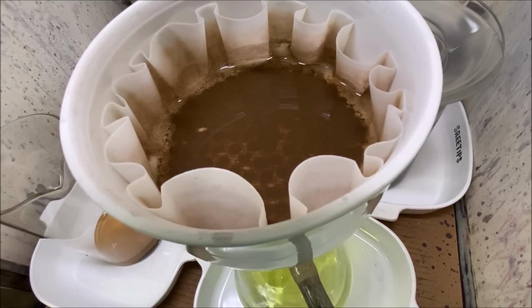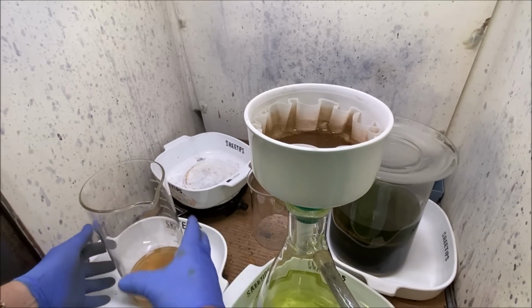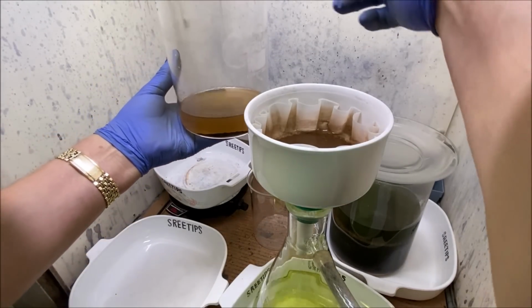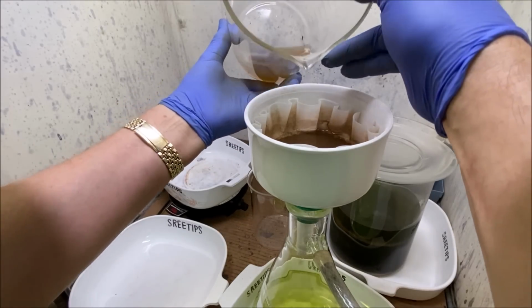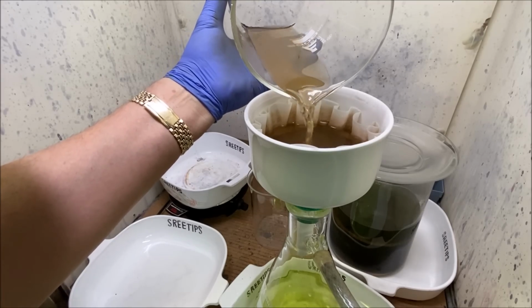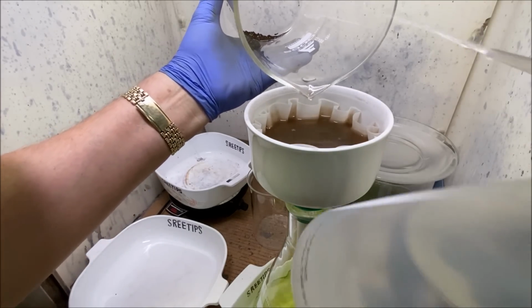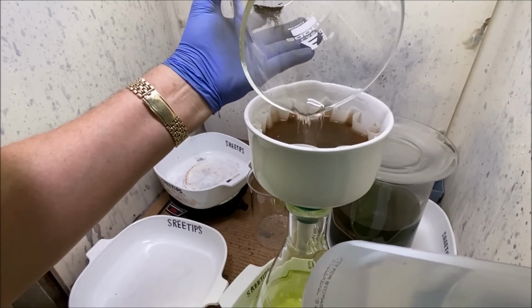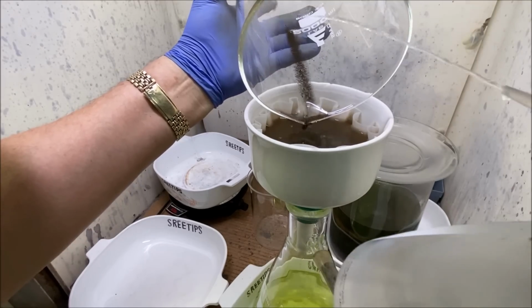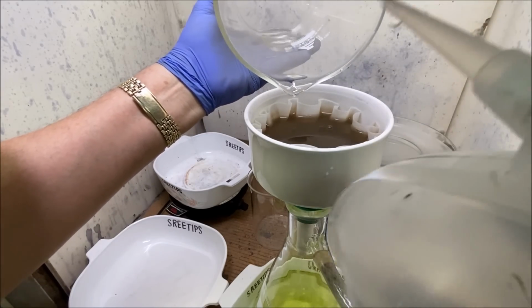We've got a little bit of gold captured in the filter, and we've got a little bit in our beaker here. Maybe might be a half a gram or so. And this is the second extraction that we did. And like I pointed out before, you don't get very much. The first one's always the biggest and the most gold. If we tried to extract any more out of those solids, we'd even get less than this.